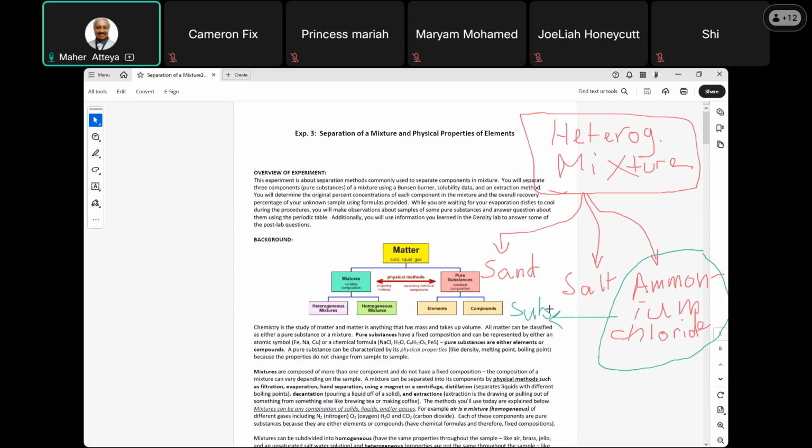Sublimation point or temperature. The salt does not sublime and the sand does not sublime. So if we heat this mixture at a mild temperature, all the ammonium chloride is gone. Then we can reweigh the whole mixture without ammonium chloride. Do we know how much we started with? We can determine what ammonium chloride lost, correct?